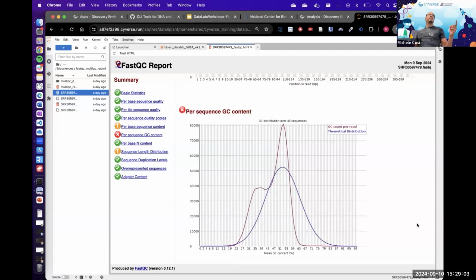This is also the other one which you should know about, which is the GC content. What is the GC content? It's literally in the name. Abundance of the G's and C's. Exactly. And what do you want the number to be? It shows in the graph. It should be a normal line that goes roughly between 49 and 51%.